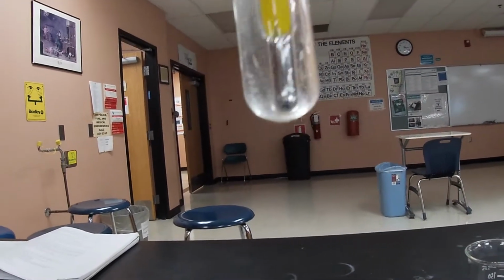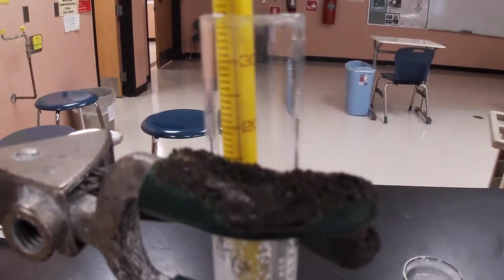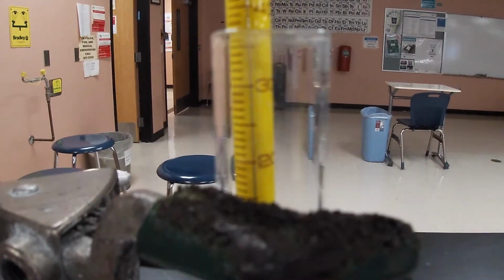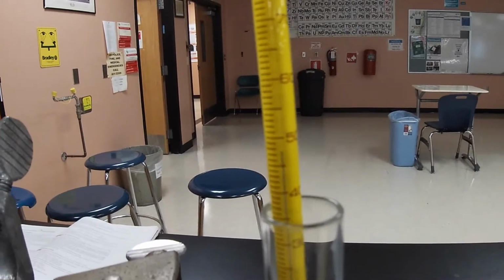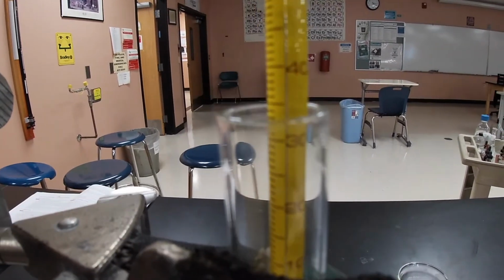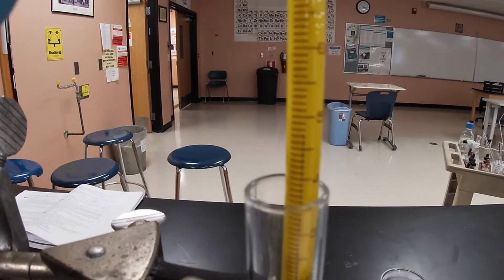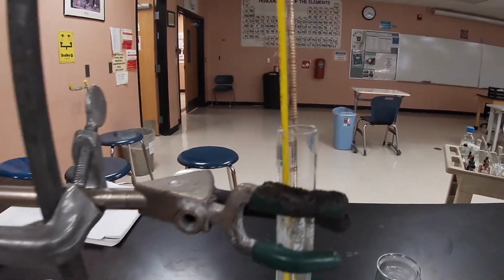If you see as I can turn. So the temperature is about, I'm sorry, not 58, 40, what is it, 48, 49. Okay. Man, can't have a steady hand today. And so there's our temperature, and that's the temperature that the crystals are forming at. I think you're recording right there. Okay. All right.